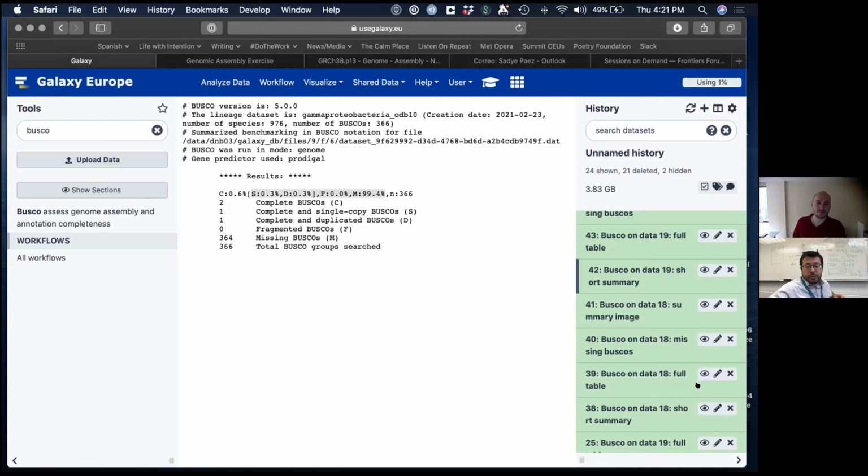So what you want to do is stitch together the alternate, right? Here the alternate is essentially pieces of the assembly that have an alternate version of it. So what you want to do is fill the gaps of that, and then you run BUSCO, right? Because you get a very small fraction. See what I'm saying? Yep, that's pretty good. And as you can see, it's also pretty fast.